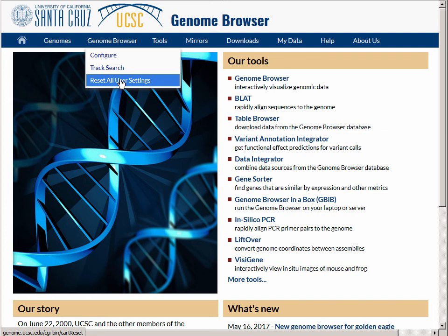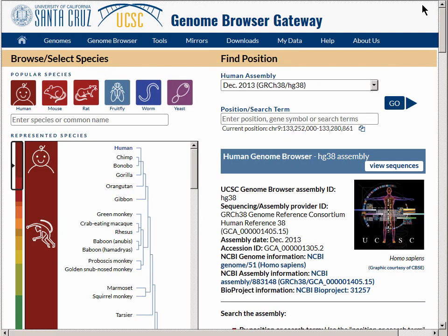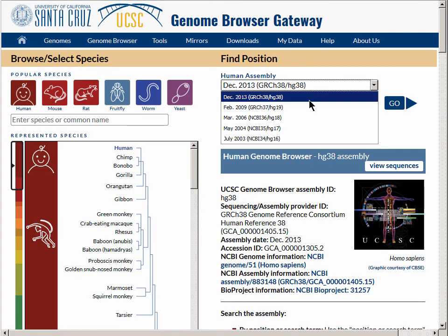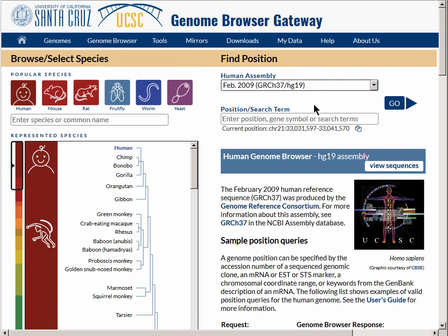This sets the browser at the HG38 default genome assembly, and we will switch to the HG19 genome assembly for this demonstration. The Go button takes us to the browser graphic.